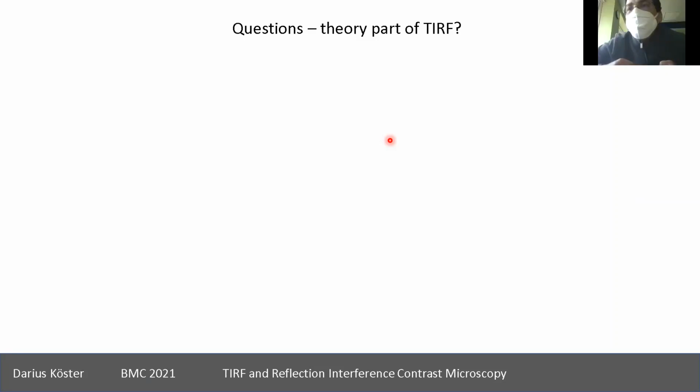Yes, I think so. So the molecules are not excited evenly, I guess. Did I get it correctly? Yes, exactly. So the whole point is that we don't excite the molecules evenly. If you think about a stack of molecules, you will only excite the ones that are very close to the surface, and the ones above will not get excited. Okay, thank you.